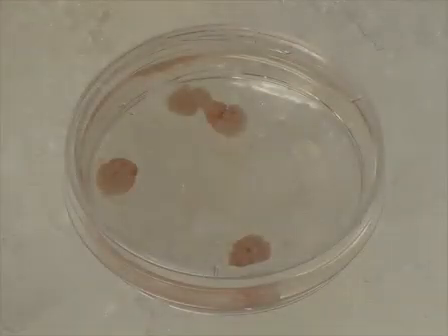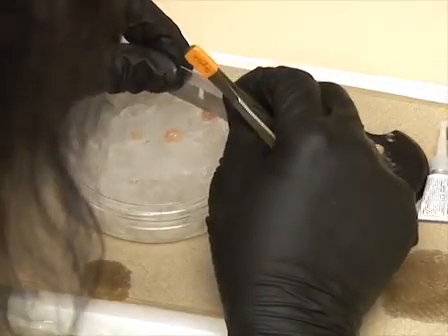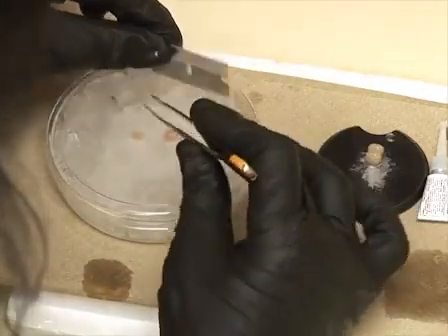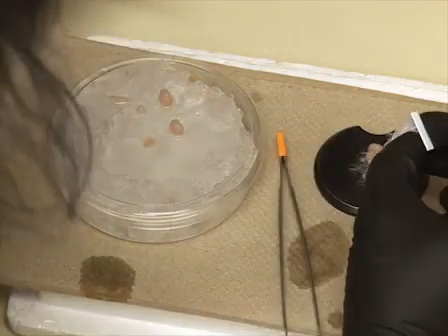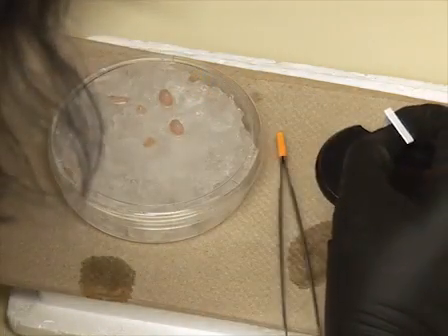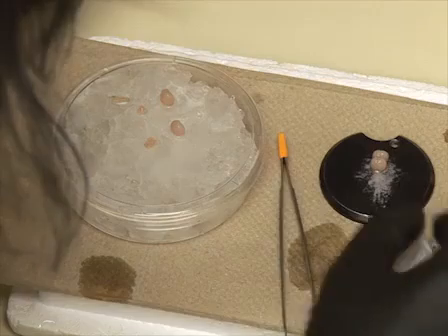Once brains have been collected, prepare to place them onto the chuck by creating a flat surface for the brains to properly rest. This is called blocking. Block the cerebellum using a razor blade and forceps. Next, put a drop of crazy glue onto the chuck and fix the first brain onto it, anterior side up and dorsal side facing you. Proceed like so with the other brains.